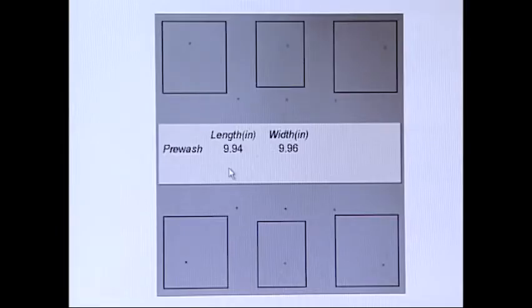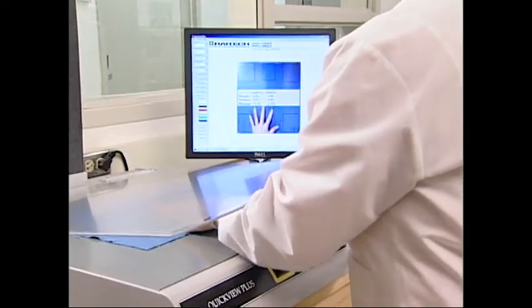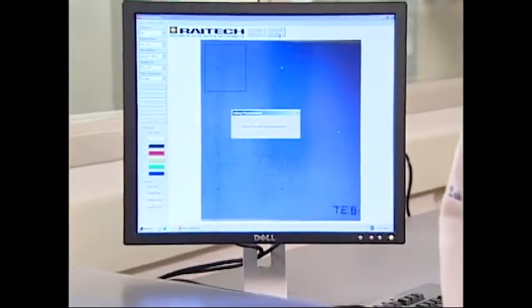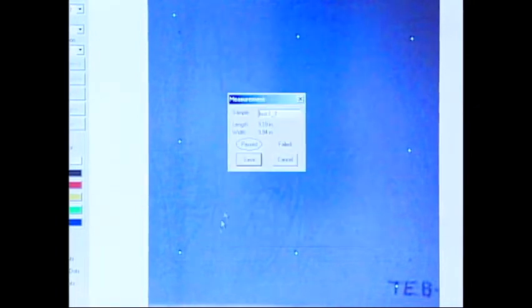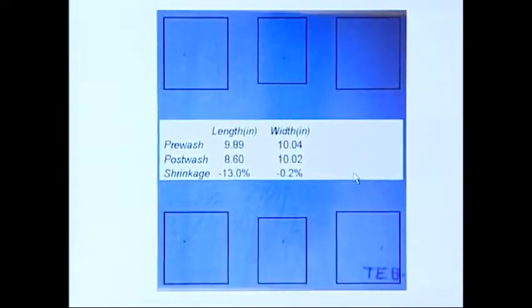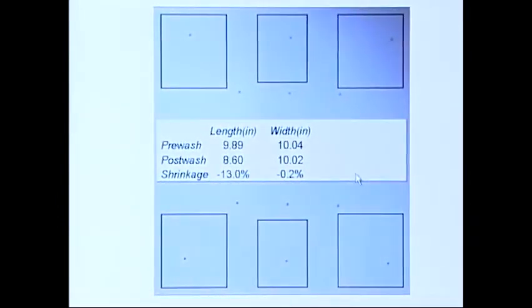This specimen's data shows actual benchmark averages prior to laundering of 9.94 inches length and 9.96 inches width. After laundering and conditioning, each specimen is again properly located on the viewing table and the plexiglass cover is lowered. The imaging system approximately locates the benchmarks, the operator then clicks onto the actual benchmarks, and a mouse click sets in motion the immediate calculation of dimensional change. In this example, the blue knit fabric has actually shrunk 13.0% in length and 0.2% in width.